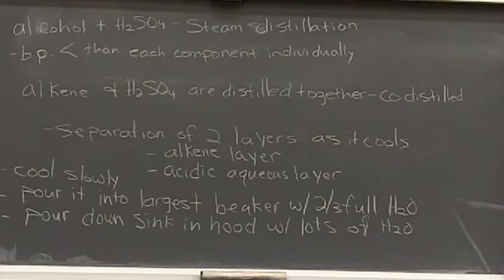those isomers and what is formed is a thermodynamic process, okay? So by heating it, you'll get the thermodynamically favored isomers, which would be the trans isomers, over the cis isomers, instead of getting what initially your product mixture is and what was initially formed from the reaction. So it'll skew your results to do that distillation, then sample it for GC. You won't get what actually just came out of your reaction, all right? So don't do that last distillation.